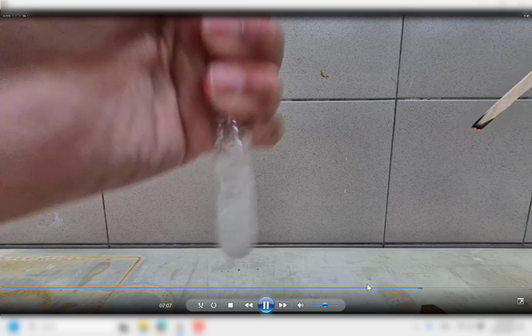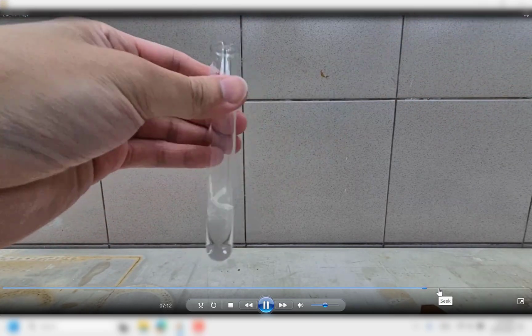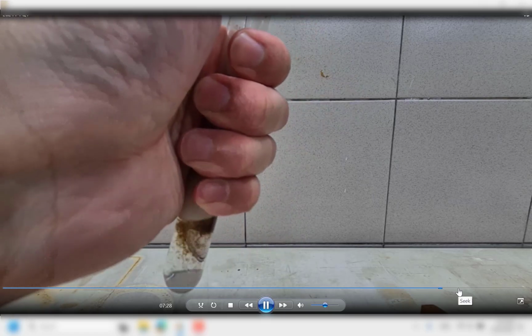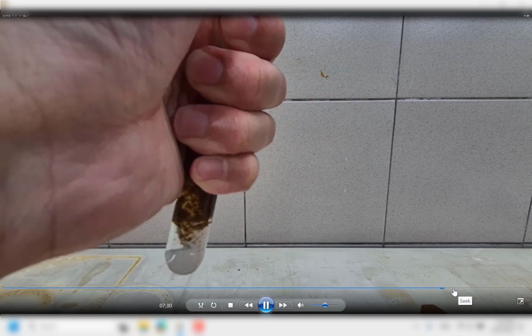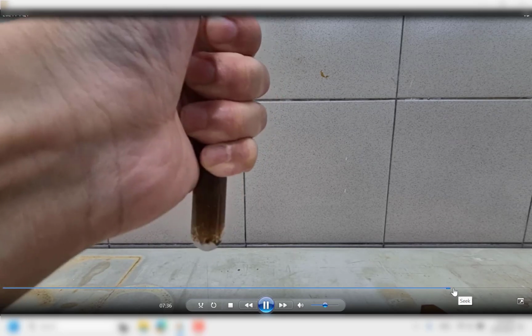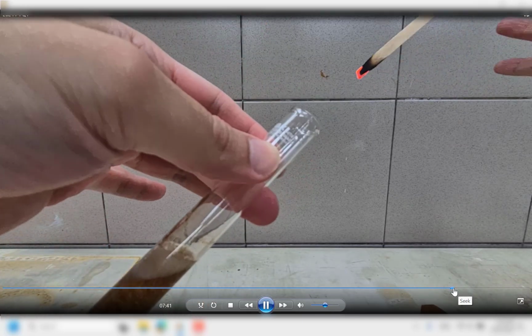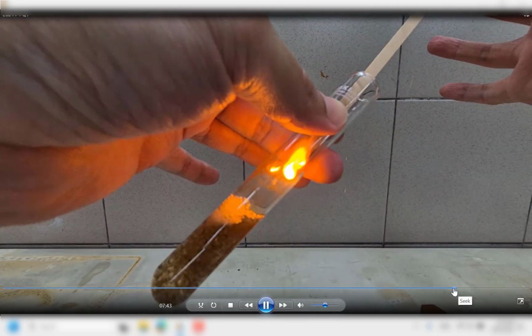And actually that's about it, because if I move on, there isn't any more interesting things I can say. It's just continuous testing or showcasing the identity of the oxygen gas. So it's not really very interesting. If you want, I can show you one more. So this one really bursts into flame.